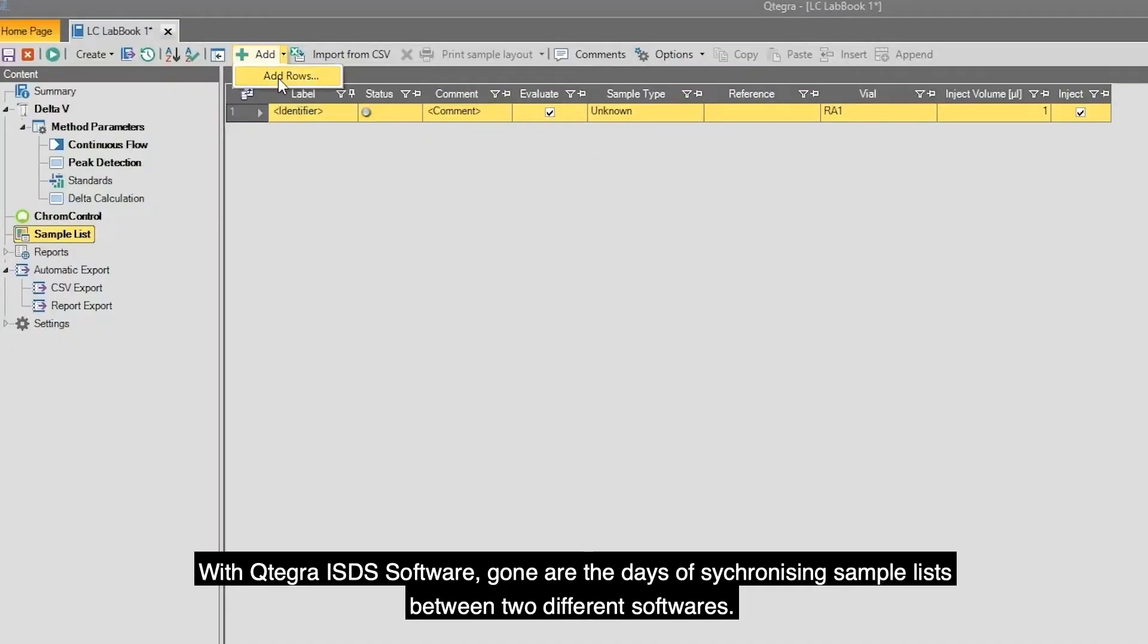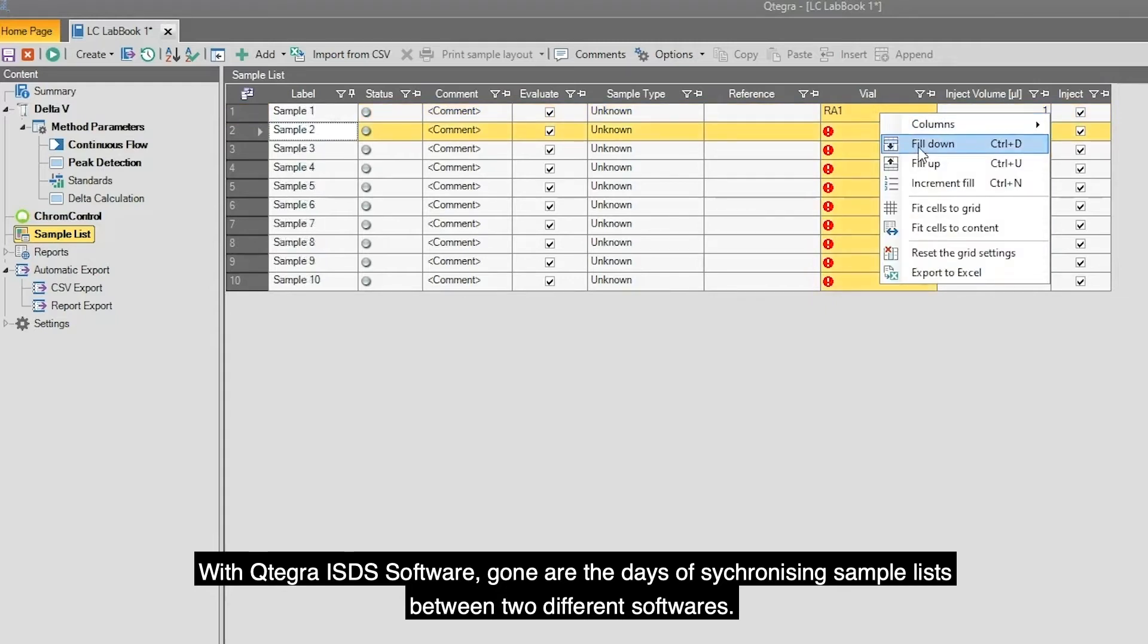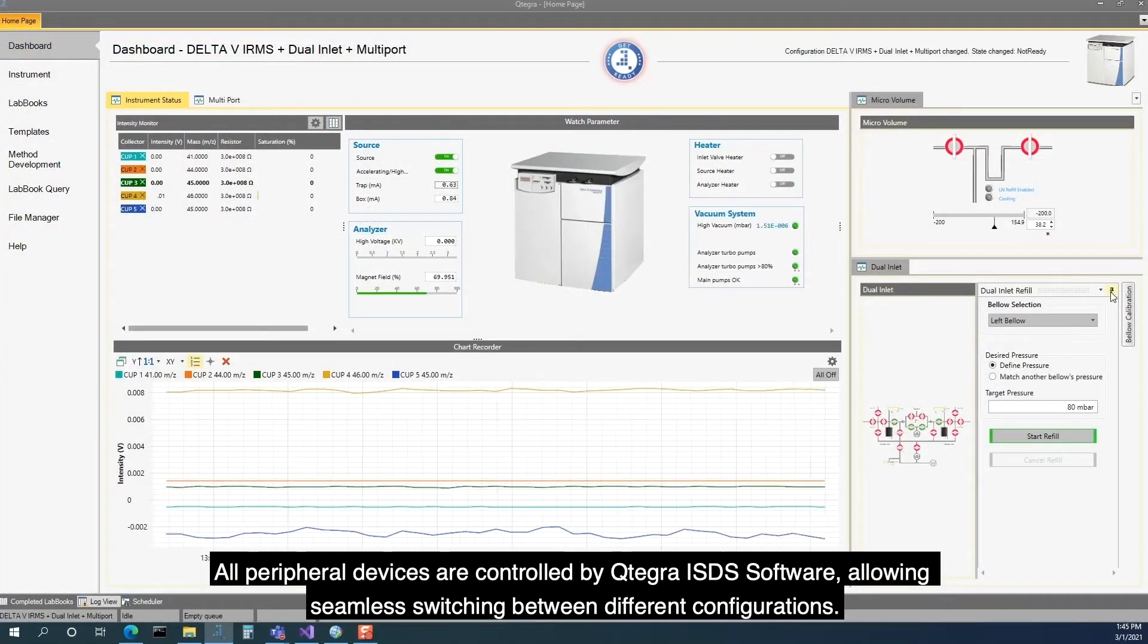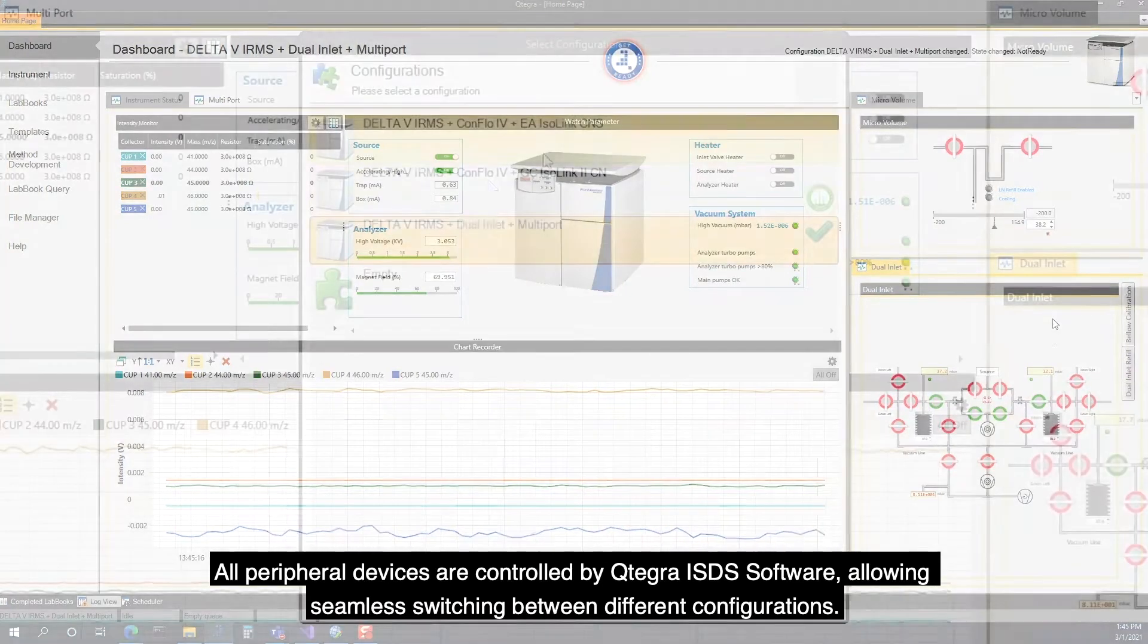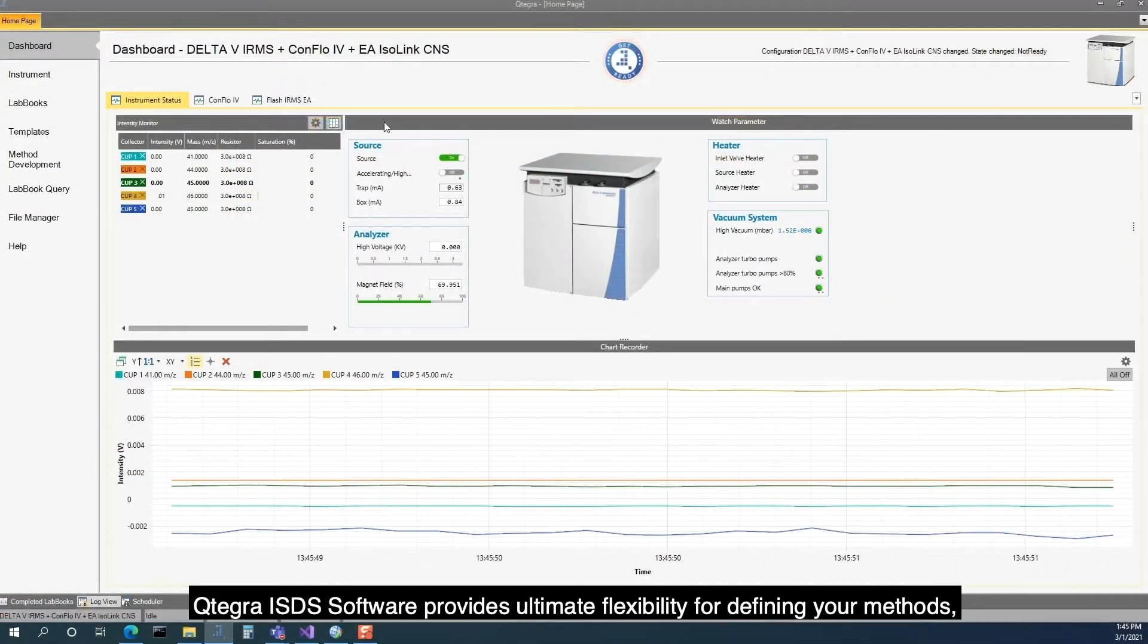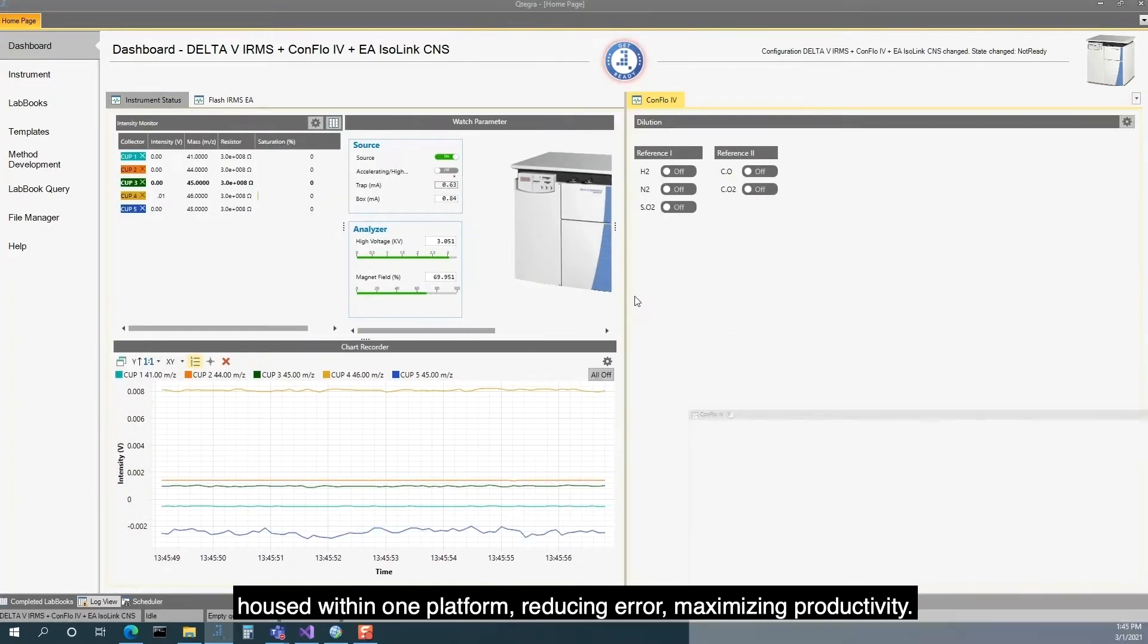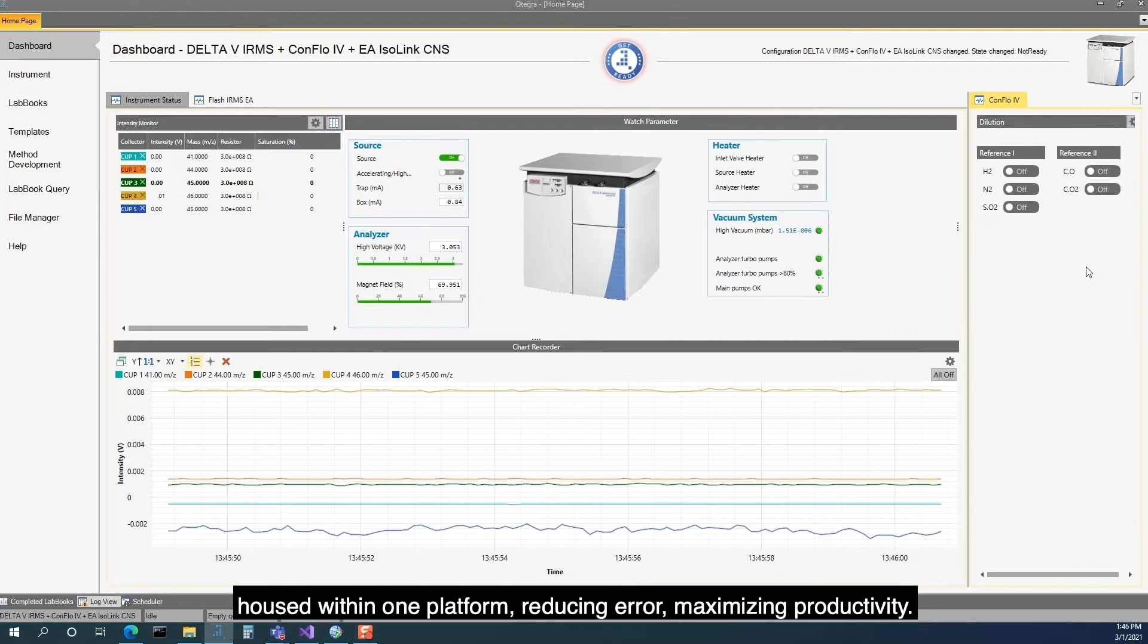With Qtegra ISDS Software, gone are the days of synchronizing sample lists between two different softwares. All peripheral devices are controlled by Qtegra ISDS Software, allowing seamless switching between different configurations. Qtegra ISDS Software provides ultimate flexibility for defining your methods, housed within one platform, reducing error and maximizing productivity.